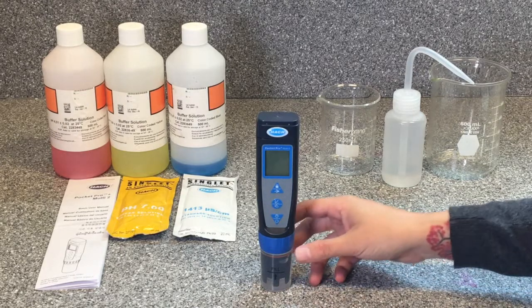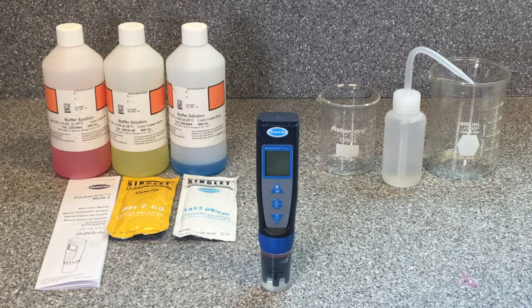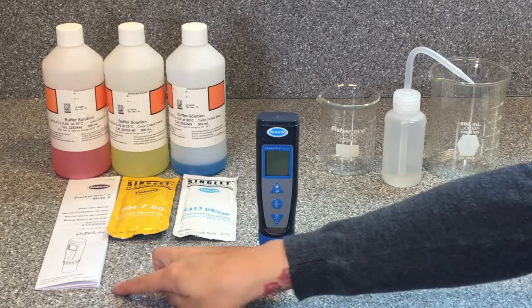A handheld Pocket Pro+ Multi 2 can be used in the field to test several water quality parameters related to dissolved solids, including pH, conductivity, total dissolved solids, and salinity. In this video we'll discuss how to calibrate the Pocket Pro. You can always refer to the manual for more information.